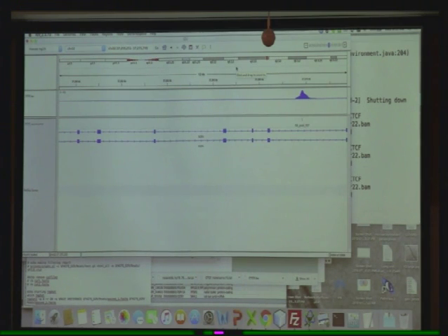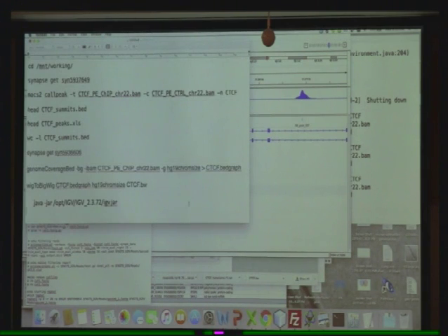Okay, did you load your bigwig? So that's what we're asking. What's the file we load? CTCF.bw. You can do most things with most file types, and I think bigwigs, you can load bigwigs in IGV, right? It's meant for that because it's small and it's easy.